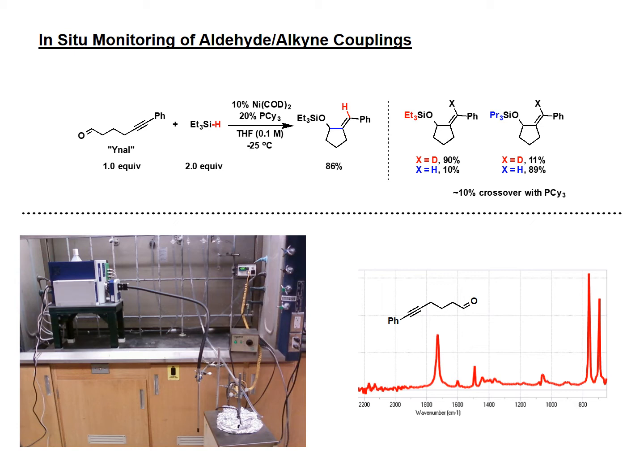And I wanted to point out, this is the instrument that we bought. During this time, there was an NIH surplus, and our program officer contacted us and said, hey, do you need any new instrumentation? If you write us a memo, we will give you money for a new instrument. And so I, as a second-year graduate student, wrote a 2-page memo and got a ReactIR 45m with the channel switching and 2 different probes, just based off a phone call from a program officer. It doesn't quite work that way now, but we were really well set up to do this chemistry.